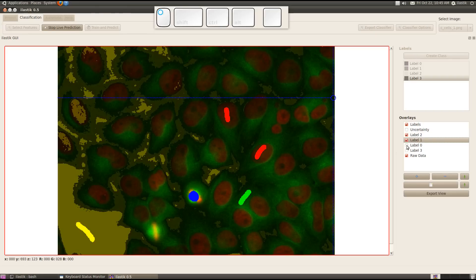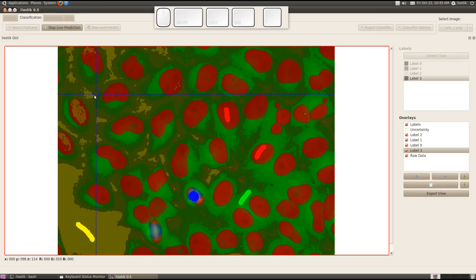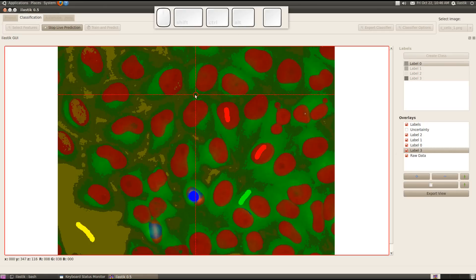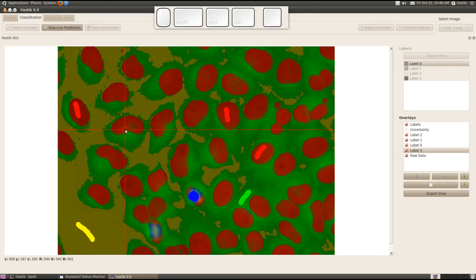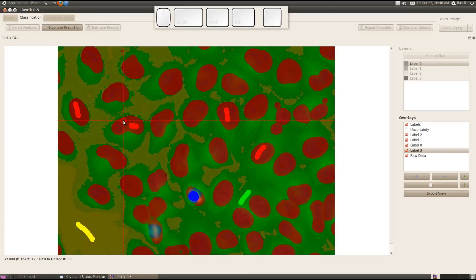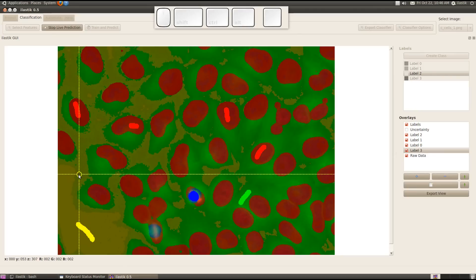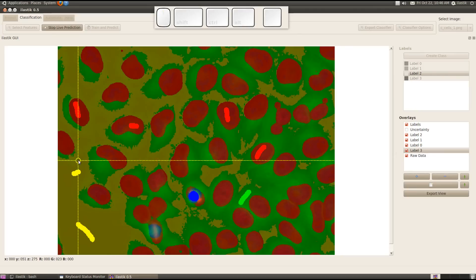It's bright in the lower right corner and shades towards the upper left corner. I can correct for this by giving some additional labels. I go to the red class again by pressing K — with K I can go through the labels — and give some more examples for cell nuclei. Elastic reacts to this input and now we are fine with the cell nuclei. I may give some more background labels, going to the yellow class and indicating a bit more background.